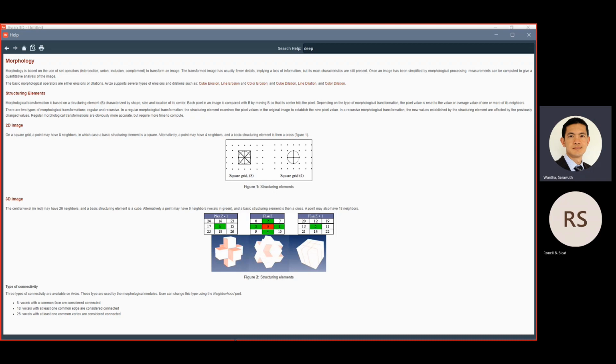In 3D, 2D is a pixel and 3D is a voxel. If you consider the voxel as a cube, the lowest number of neighbors you can take into account is only the ones that share a face with the cube. In the medium option, you also consider the voxels that share an edge with the center voxel.